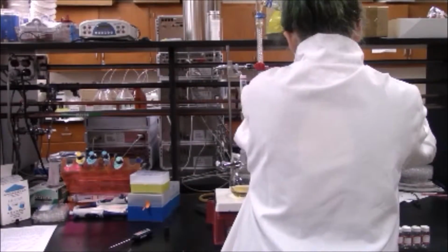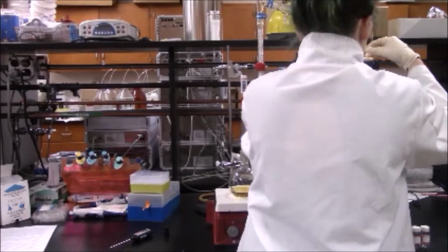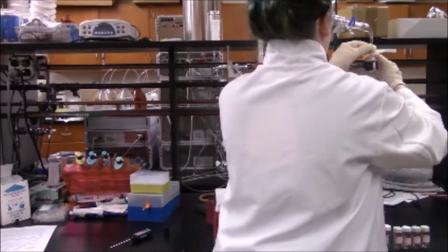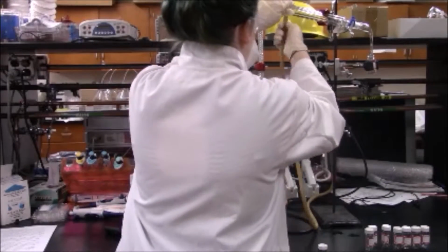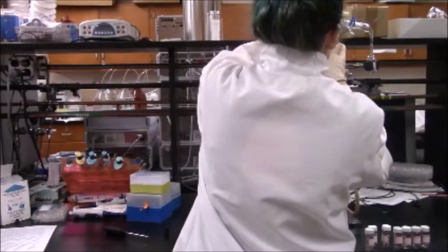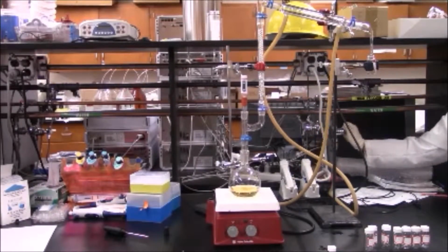In this experiment, all samples of condensed vapors will be collected and measured for ethanol concentration. All collected ethanol should then be summed up and compared with the starting ethanol. This is called a mass balance, and our balance should be close to 100%. We will also take careful measurements of the distillation process, including temperatures of the liquid in the bottom flask and the vapor at the top, as well as volumes of ethanol product collected.